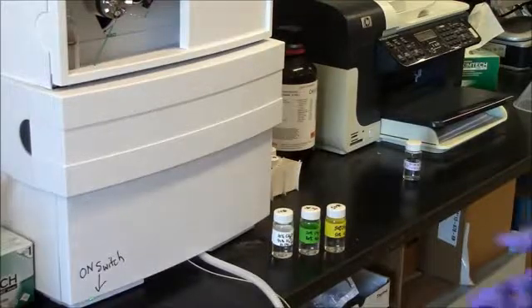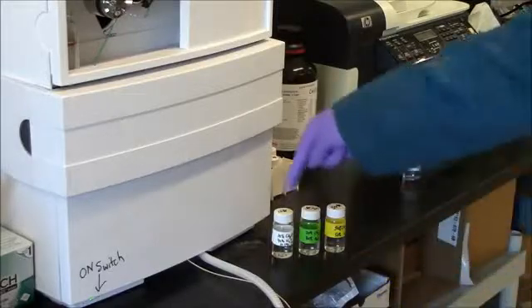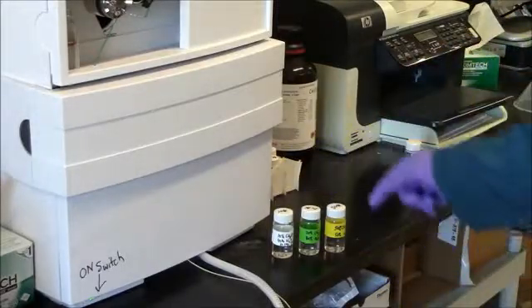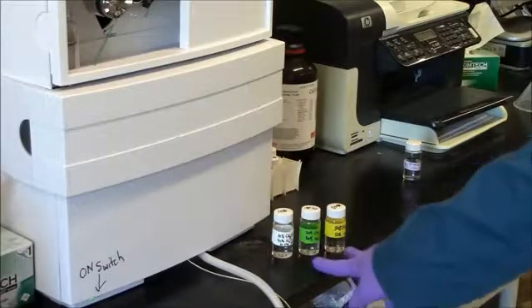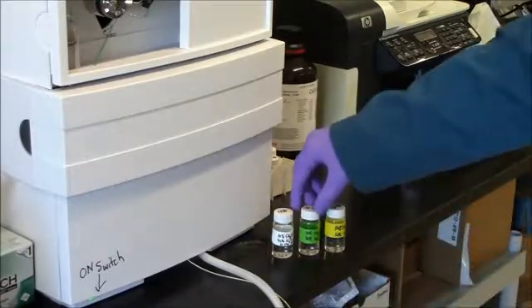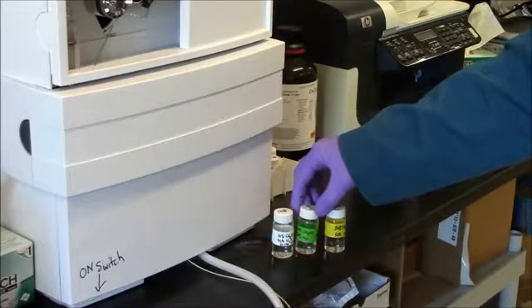For the HPLC, you use different solvents to dilute your sample. I've labeled these as 10 star, 20 star, 50 star. The number indicates the percent acetonitrile in these mixtures. The star indicates they also had trifluoroacetic acid. It's an acidulant. It's 0.1%.